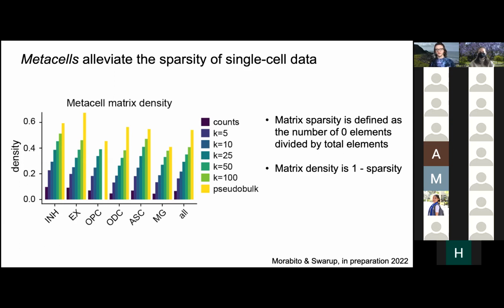So I don't know. Just by using this a bunch of times, I've pretty much only used 25 or 50. What if the data set is much larger? Would you increase K or should you just stay at 25 to 50?